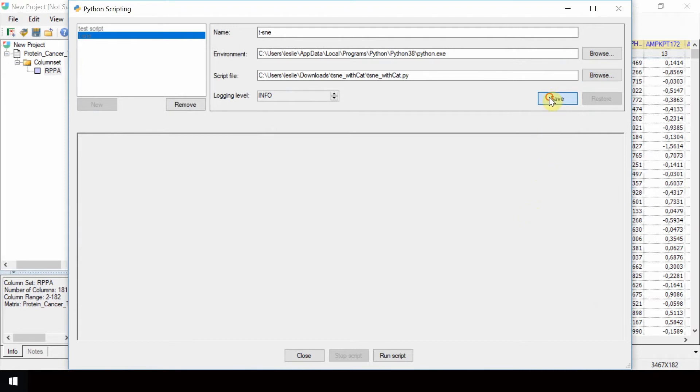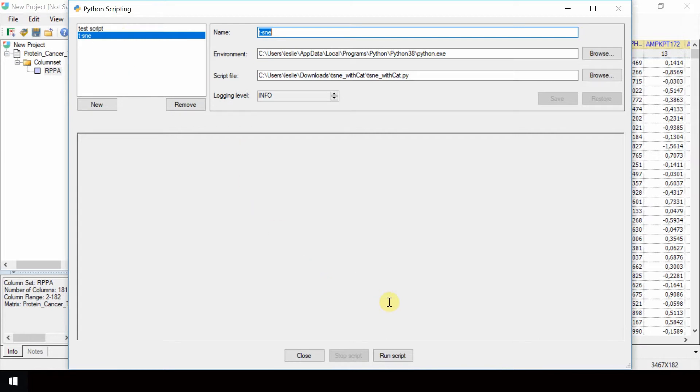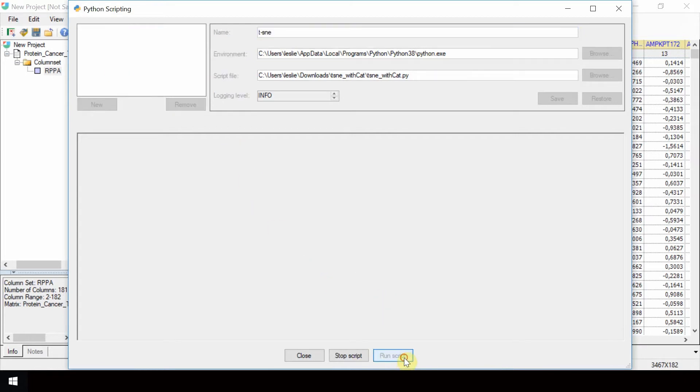Click the Save button to save these settings. This will make the TISNY configuration directly available from the pre-configured list in Tools, Python Scripting. Click Run Script.